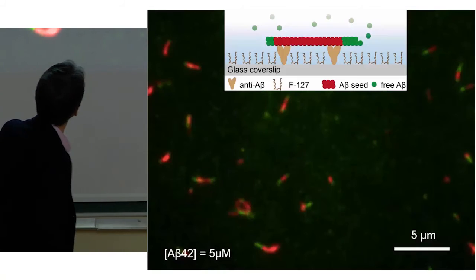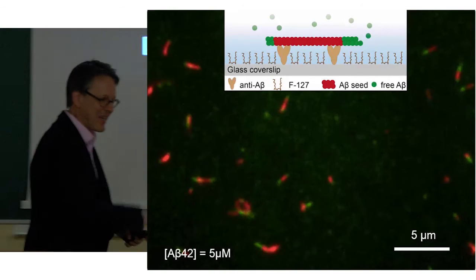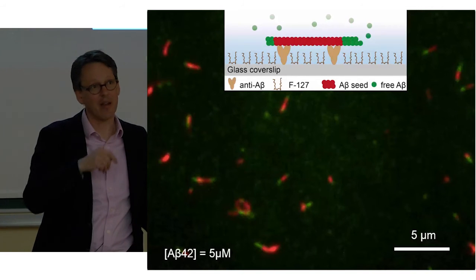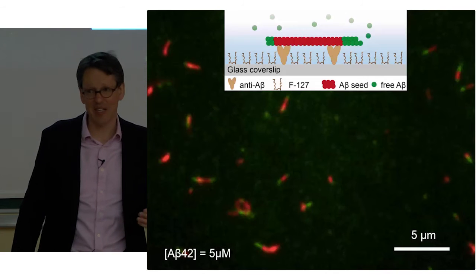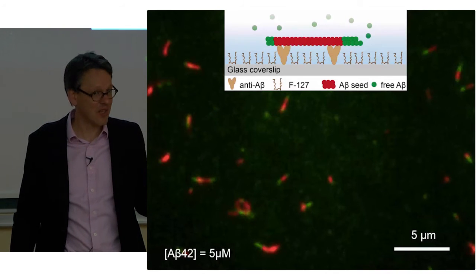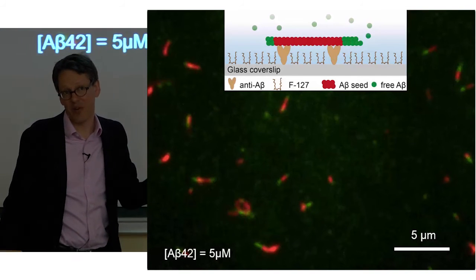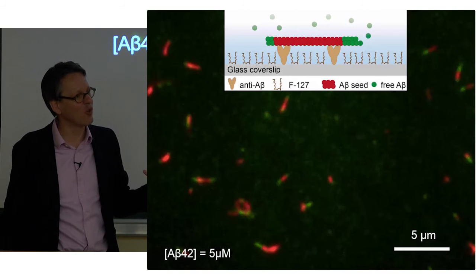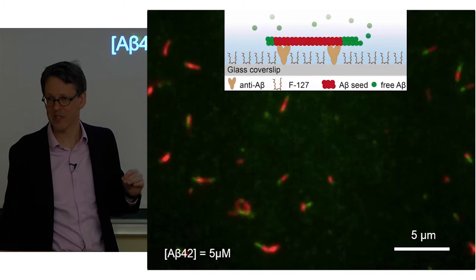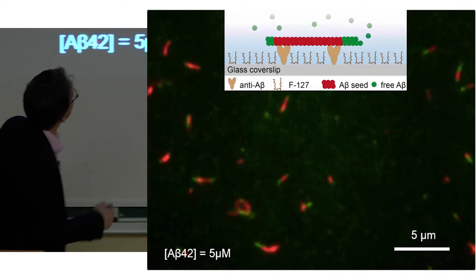And that then allows us to look at things in time, because I need 9 images to generate one super resolution image. And with a good camera, a good system, I can take up to 150 images per second, right? With a scientific CMOS camera, that's about as far as I can go. And so if I roughly divide that by 10, I can go up to, if you do it really, really well, 15 hertz with this technique, right? Here's a slow example first, but it's an interesting one.